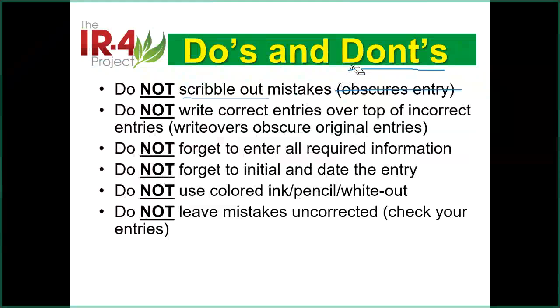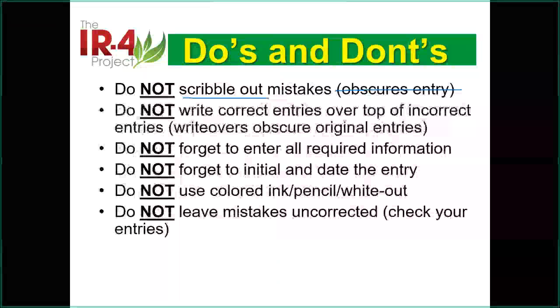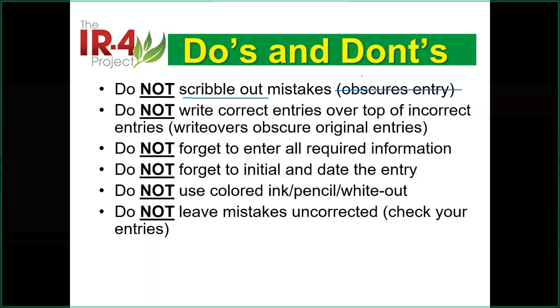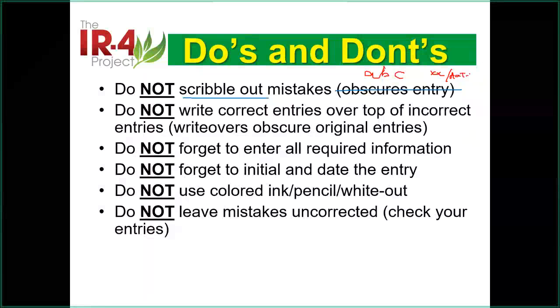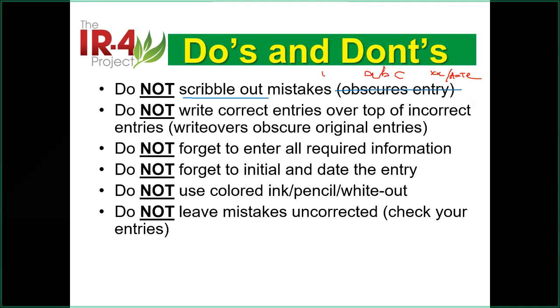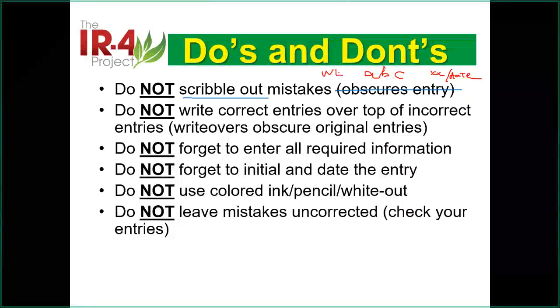Then I write something: this is the correct number, and this is ABC. The ABC is correct. Then you always sign your name here and the date of the entry. Always do that. Of course, you always need to give a reason why you make this change. For example, this is the wrong entry. Sometimes we call that a WE.